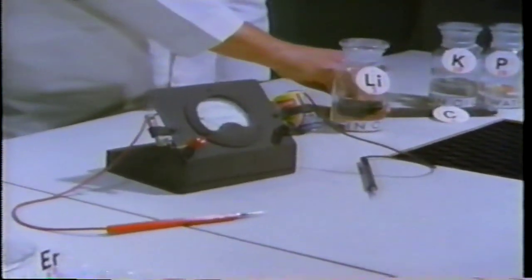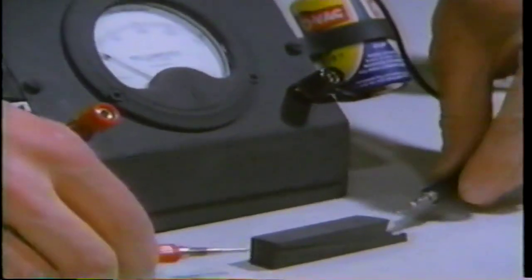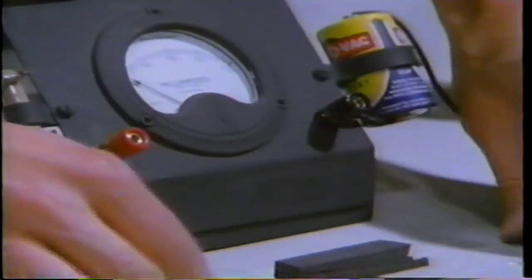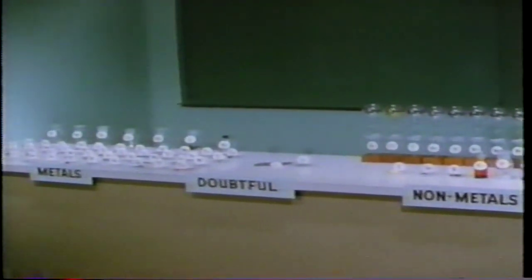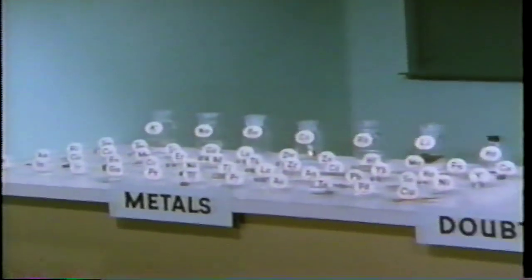Here is carbon in the form called graphite. It has little shine, and under stress it breaks rather than bends. Graphitic carbon is hardly metallic in these properties. But look, it is an excellent conductor. It conducts like a metal, but is not very shiny or ductile. When we use the criteria of shininess, ductility, and electroconductivity, we find that there are about 4 times as many metals as nonmetals.